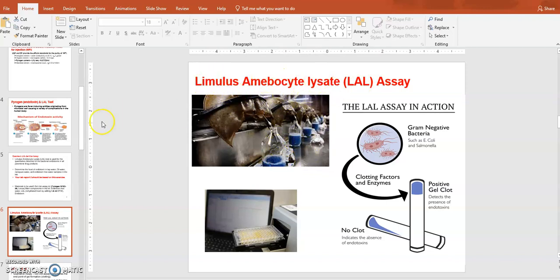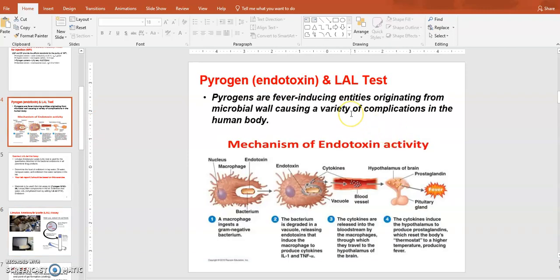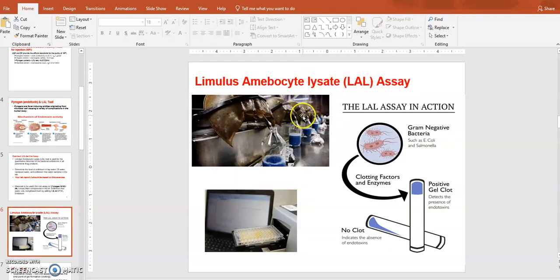Those are LAL. So those special proteins, compounds isolated from horseshoe crabs, are used because they have reactivity with the endotoxin. If there is endotoxin present, these lysate proteins will bind and coagulate, meaning what? They will form a network. They will develop some kind of agarose-like, gel-shaped material. So that's what LAL would do in the presence of endotoxin.